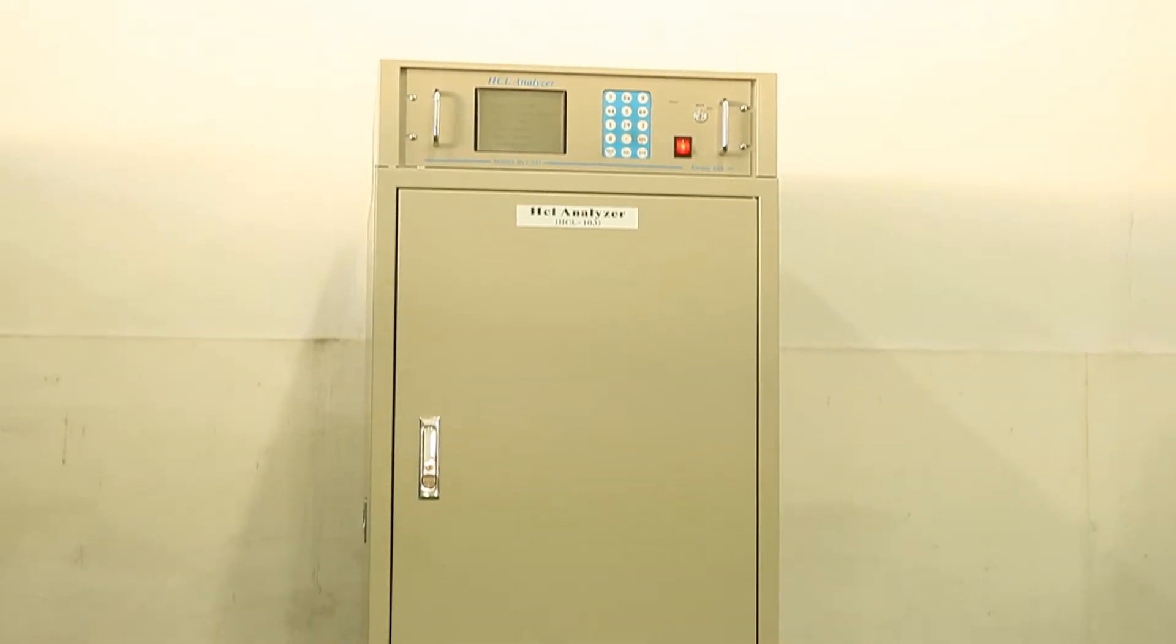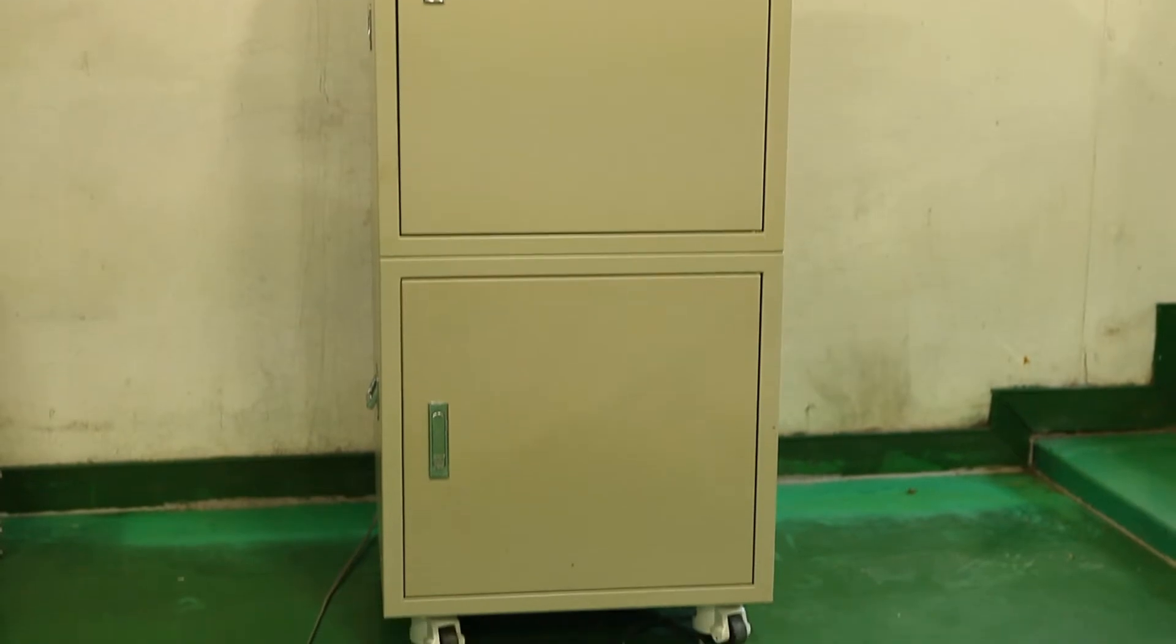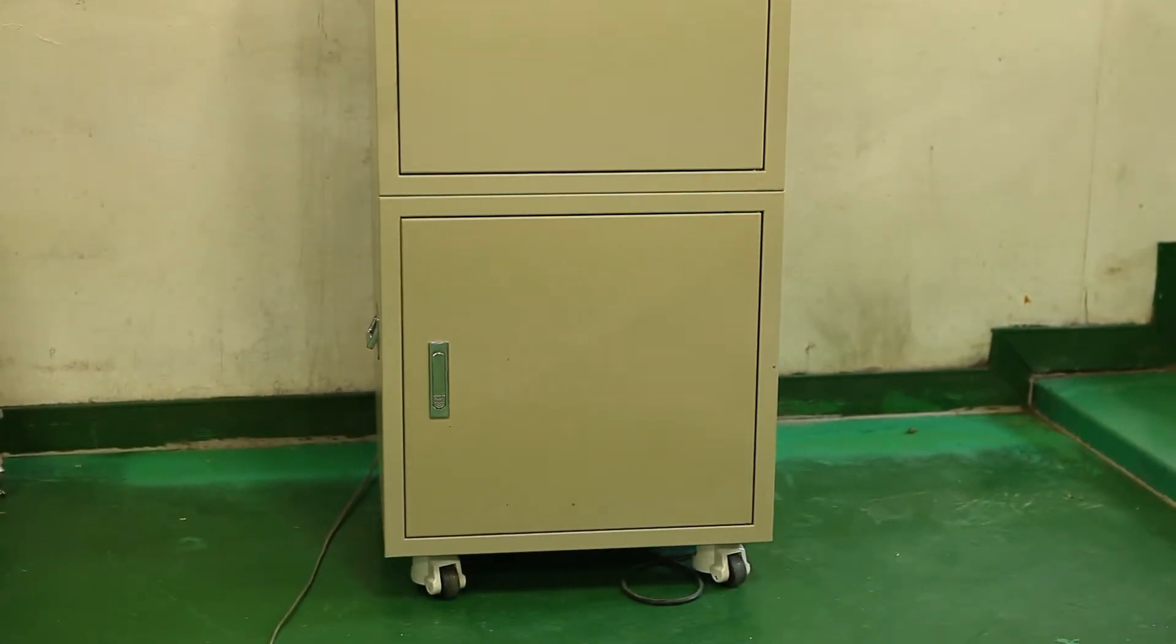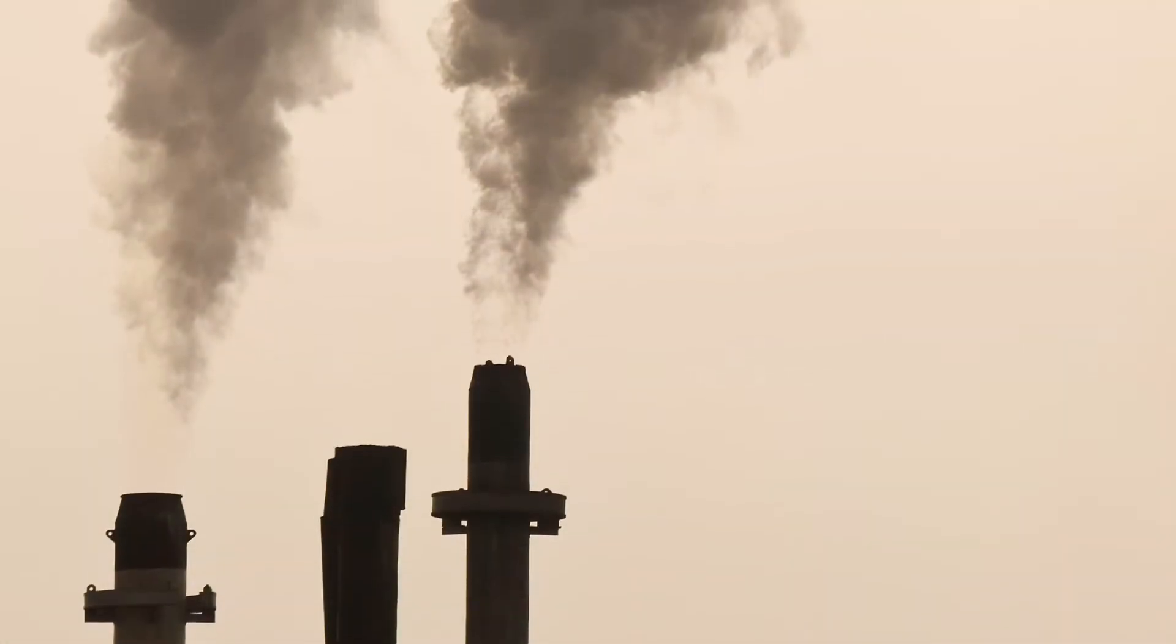The HCL analyzer HCL 103 is a device that measures the HCL concentration in exhaust gas which is discharged from burning up equipment of urban waste.